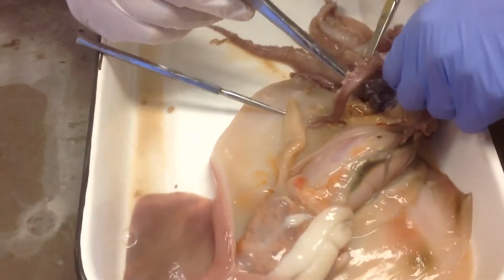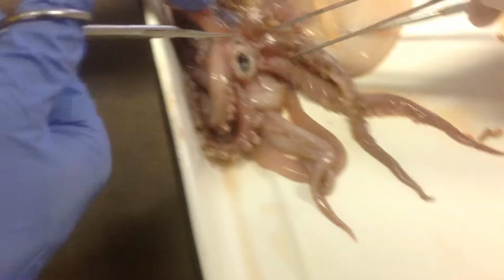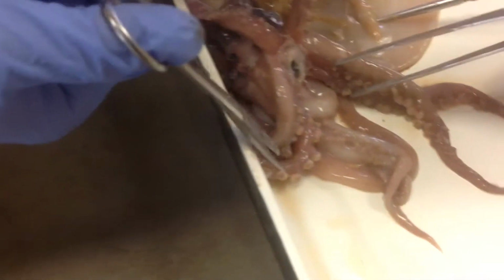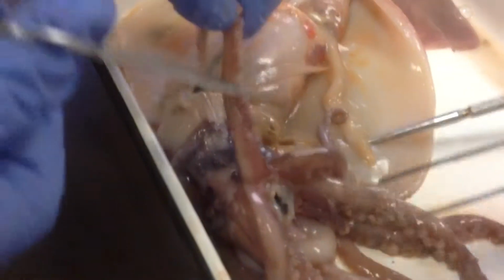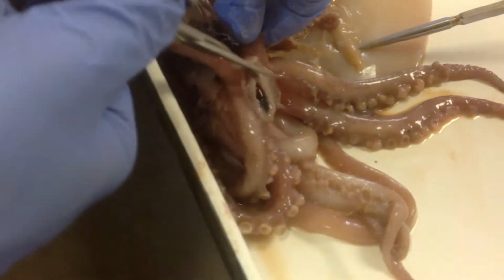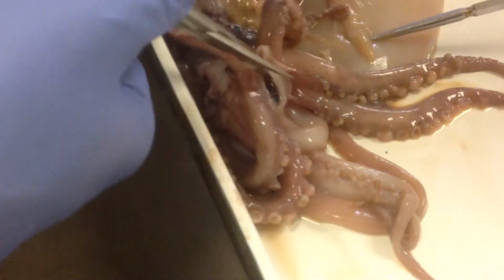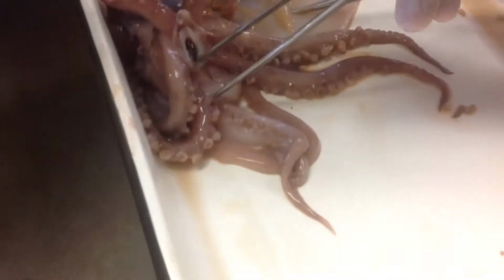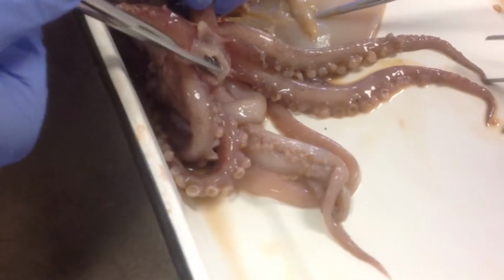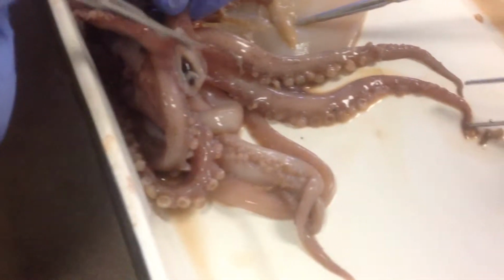Okay, but this is an ink issue over here. That's definitely the mouth. It's a beak-like formation. Two hard bone-like structures. It looks like it's used to grab on, maybe with the help of these tentacles. There's little circles on this, for traction most likely. There's suctions, once again, to latch onto prey or surfaces, and this beak can probably do some damage to its prey. It's probably not eating big things, judging by the size of this. Most likely smaller invertebrates. So therefore it'd be more of a carnivore rather than an herbivore, possibly an omnivore.